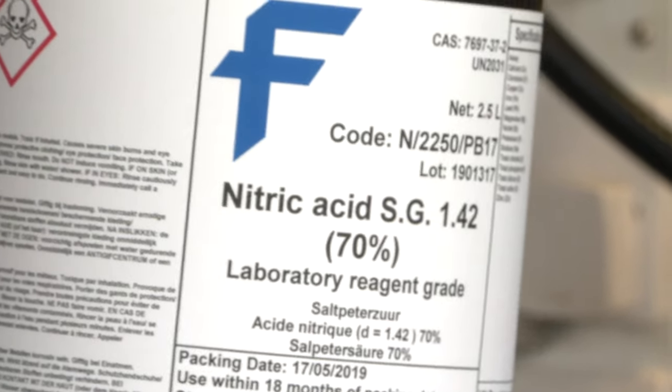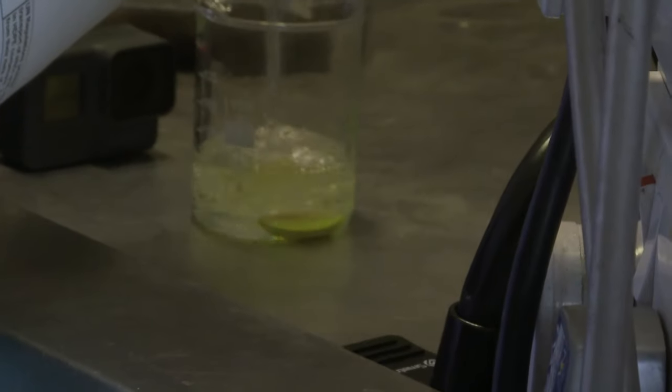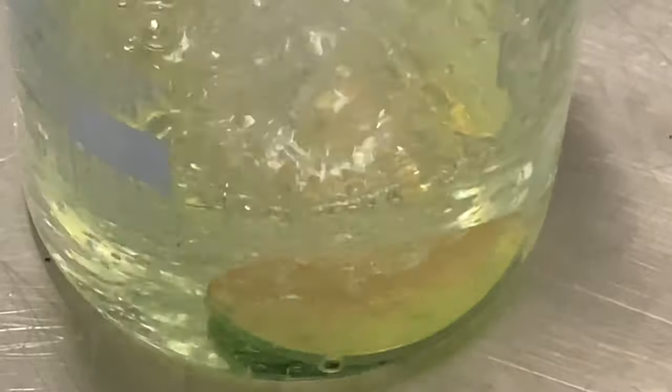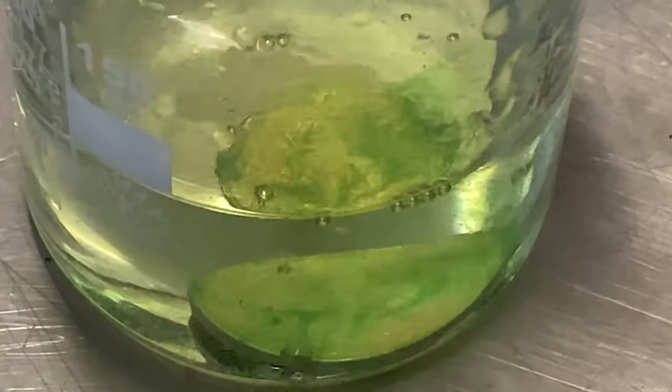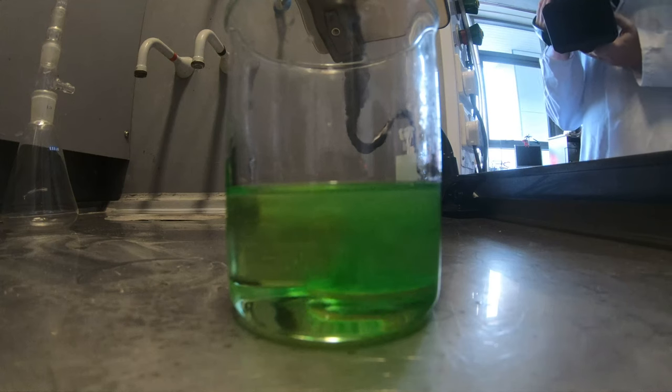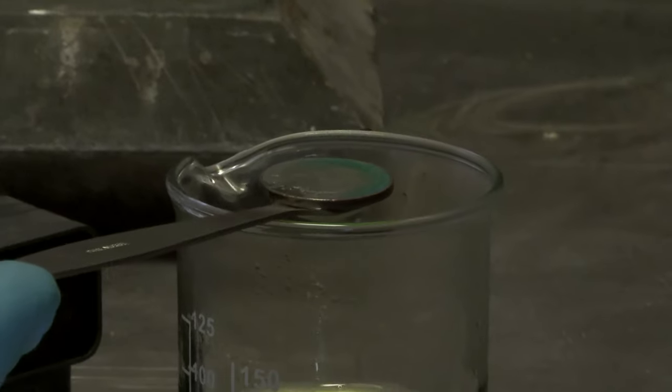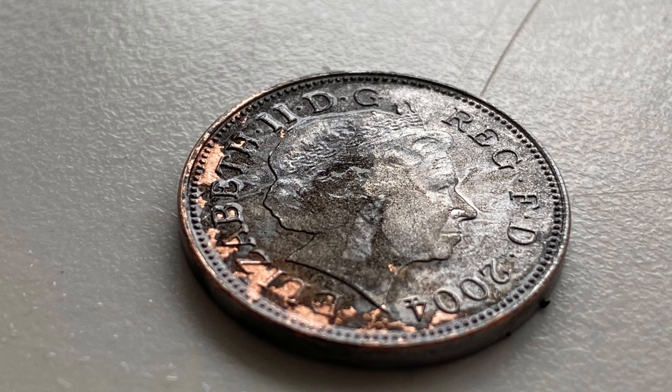Neil decided to do it again, and he repeated the experiment. The reaction happened. And this time, the coin came out just as we expected. Copper was gone, but the iron and the picture of the Queen was there.